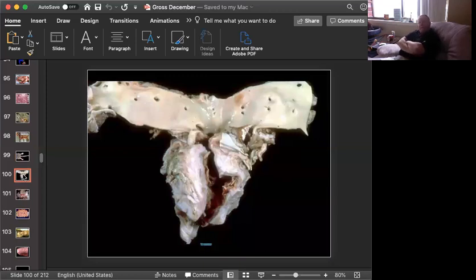Tissue from a horse. Can you give me a morphologic diagnosis and a cause? Okay, it's a great picture. This is a fixed lesion. We're looking at the cranial mesenteric artery of a horse, which is a classic site for the temporary home of the stage 4 and 5 larvae, not adults, but the larvae of Strongylus vulgaris.